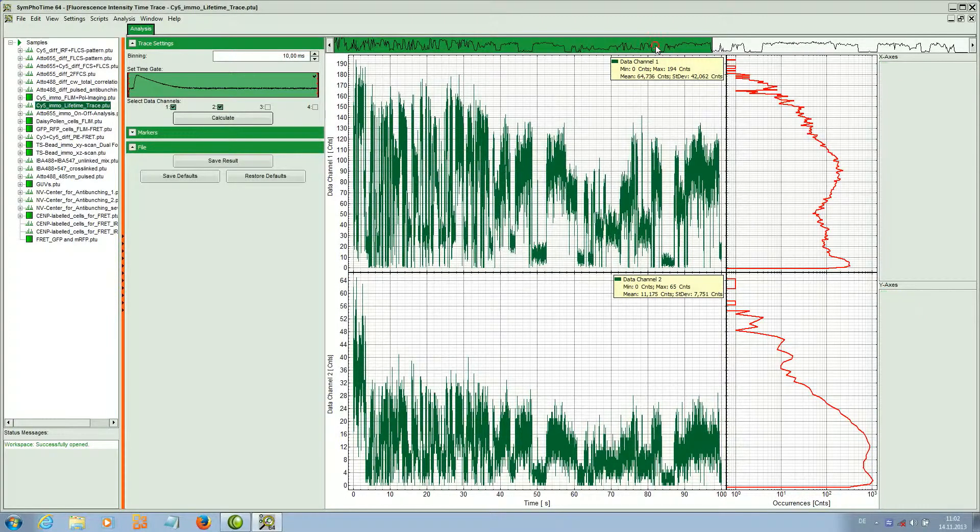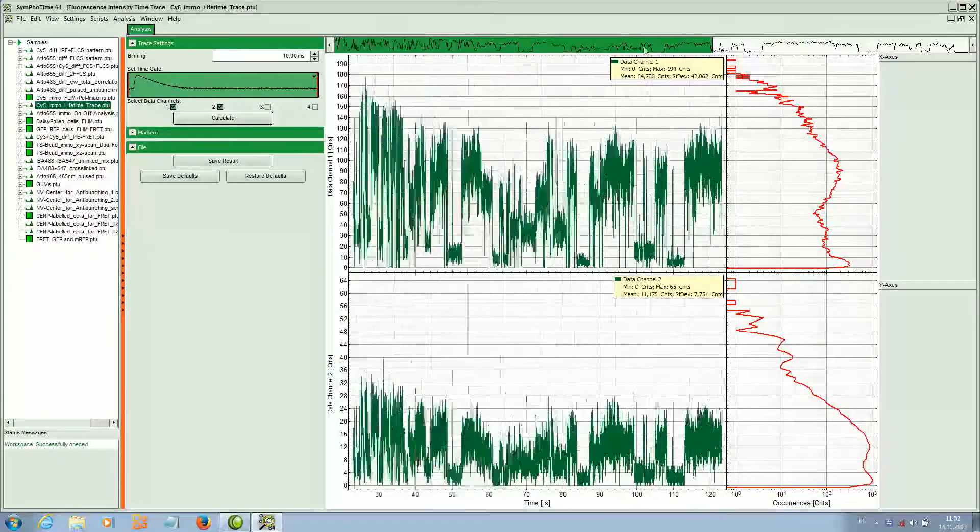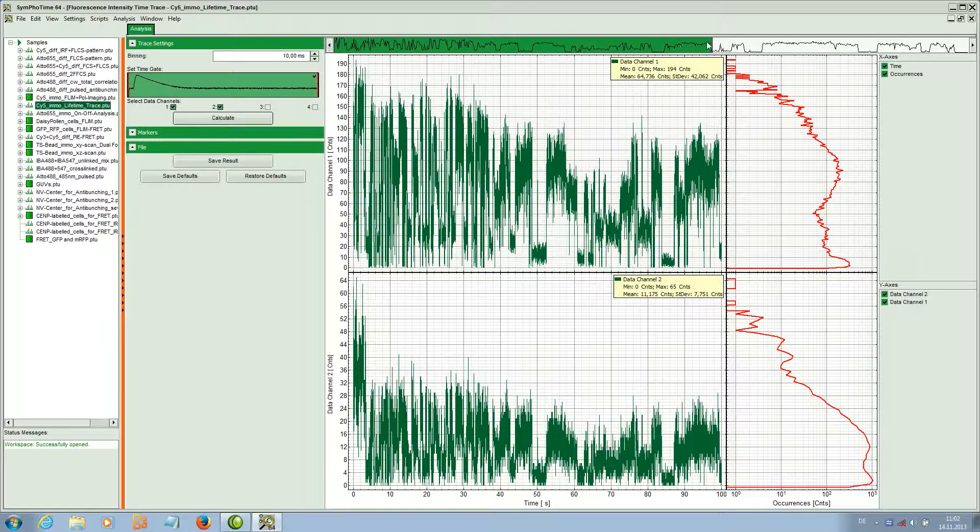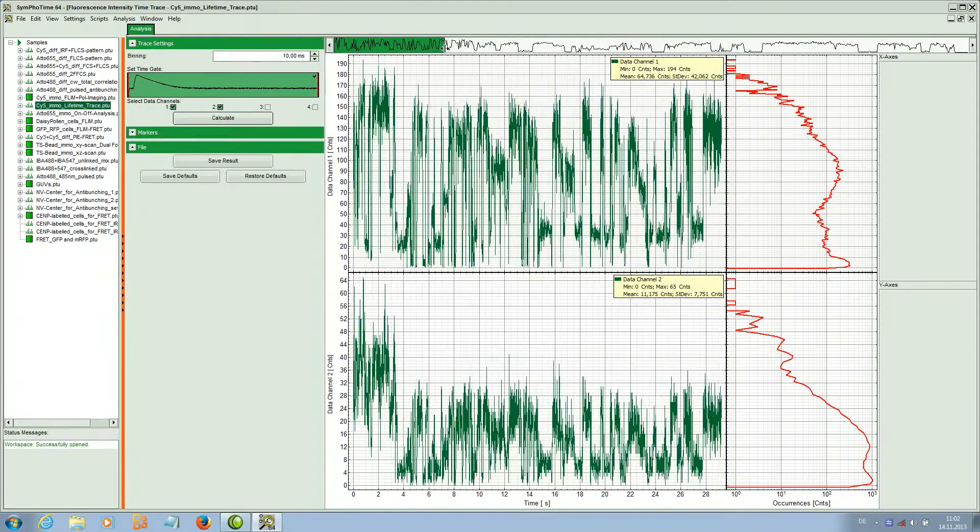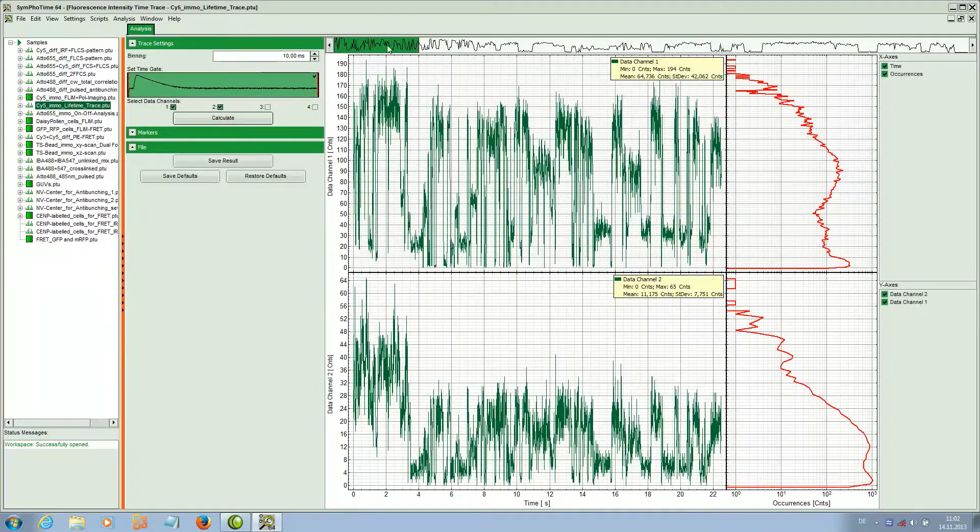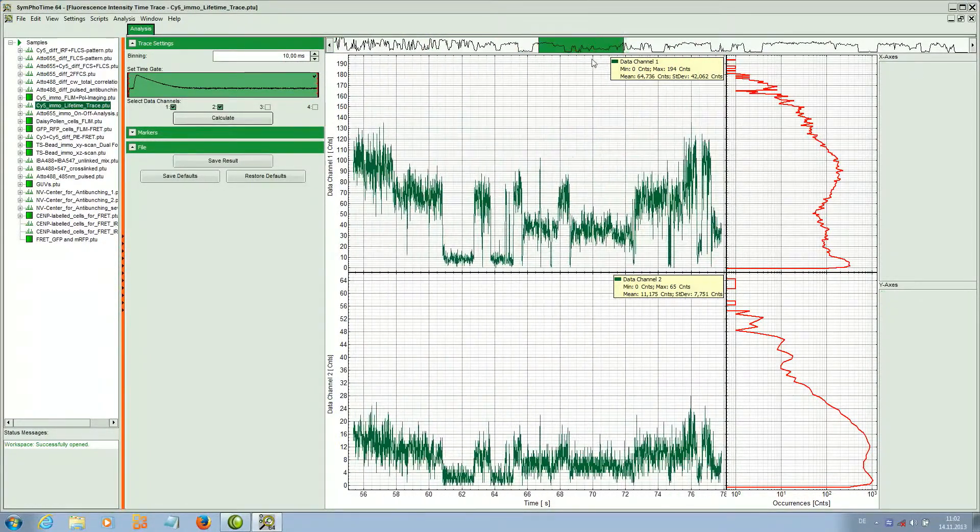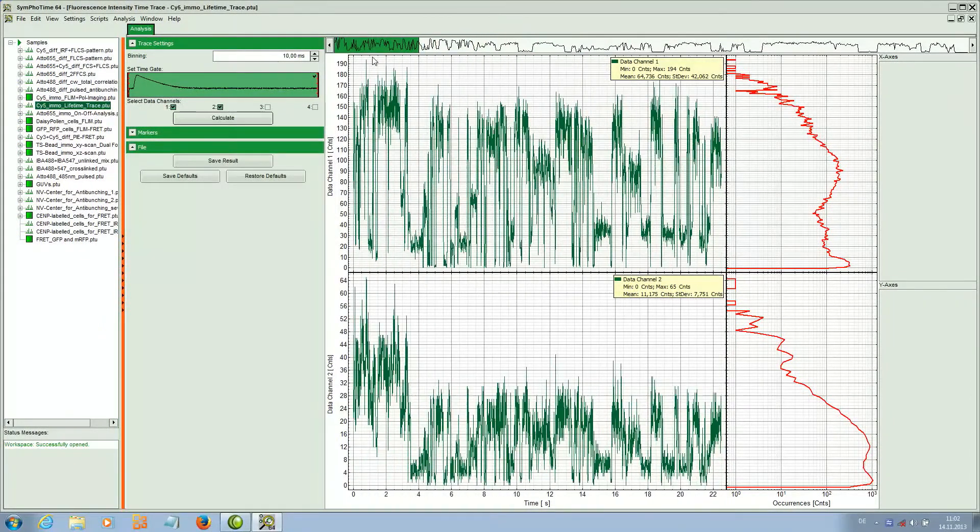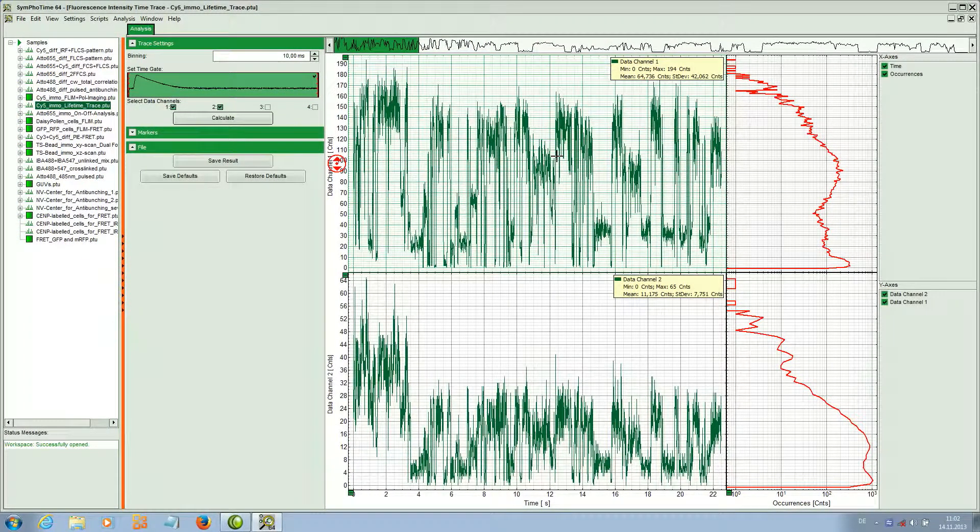Here we can screen through the data. This upper panel contains the whole time trace and I can also zoom in here. In the lower window, the green enhanced part of the upper window is displayed.